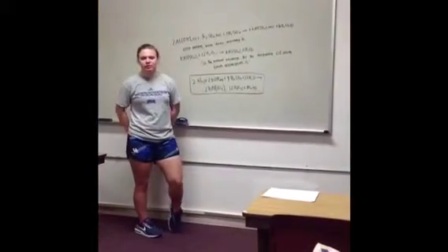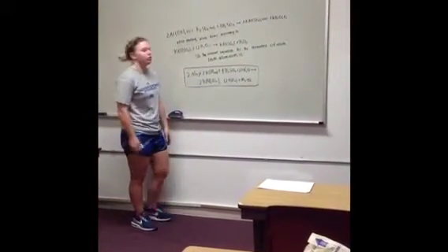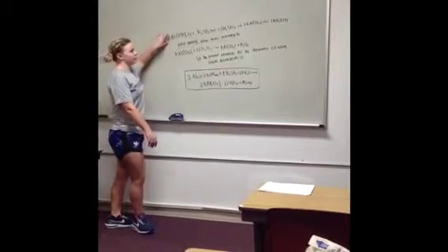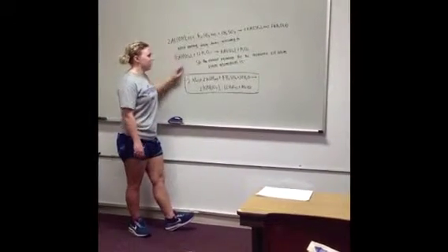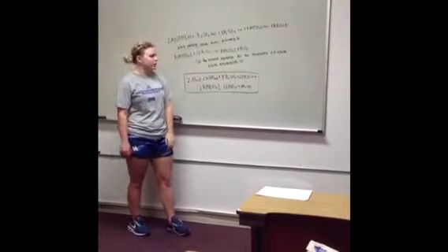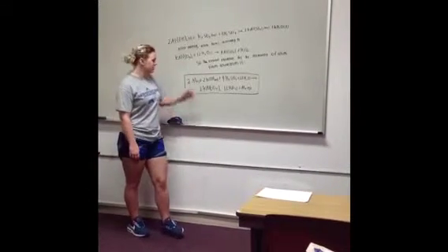So coming from the previous equation that Abby told us about, you get this. And then after cooling, alum forms according to this equation. And then the overall equation of the formation of alum from aluminum is this.